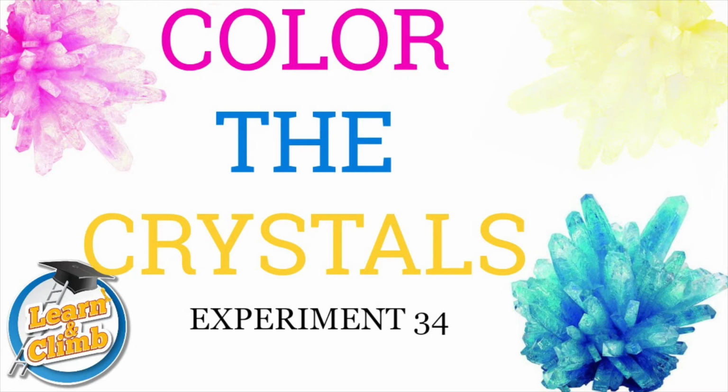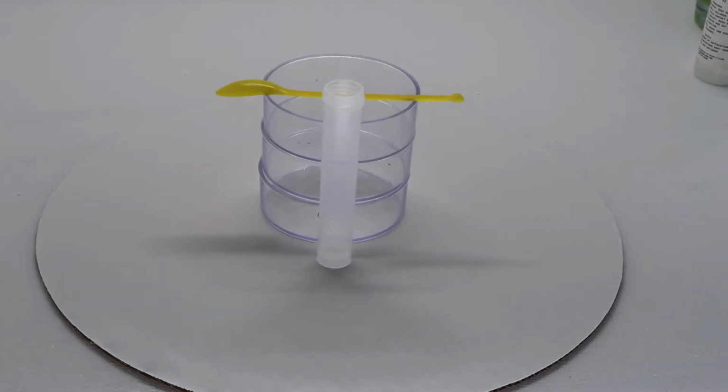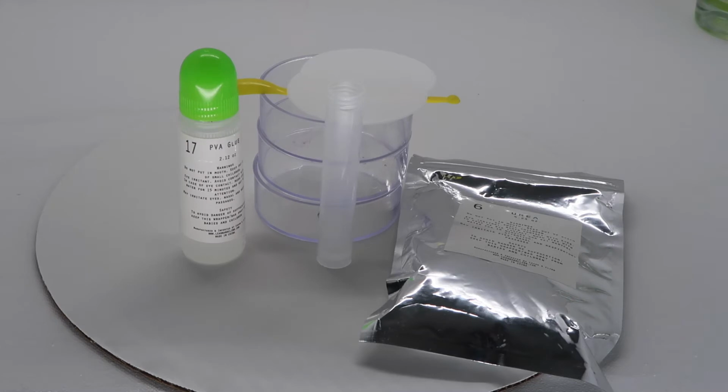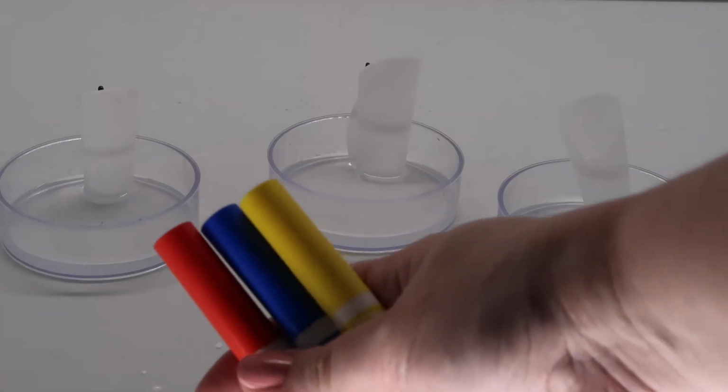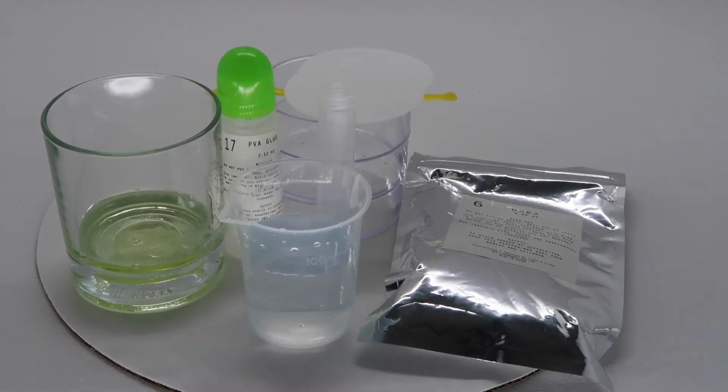Experiment 34. Color the crystals. Tools needed from kit: 3 petri dishes, yellow measuring scoop, 1 small test tube, 3 filter papers, packet 6, which is your urea, and bottle 17, which is your PVA glue. Ingredients needed from home: 3 non-permanent colored markers, dish soap, and water.